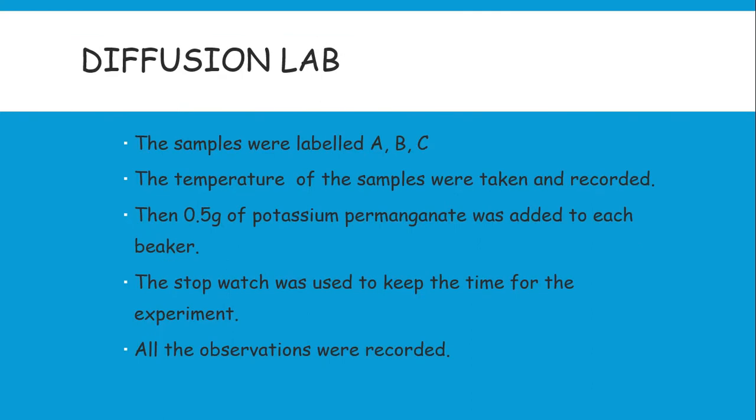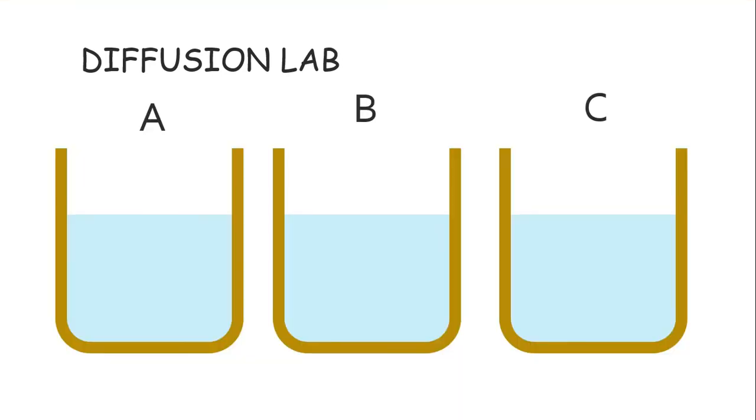So here we have our 2 slides. These are the slides that you'll be writing, and the black writing here suggests that it has been written now in past tense, just the way you are supposed to write it. Now right after our procedure is going to come our diagrams, and the diagram represents the setup of the lab that you are doing.